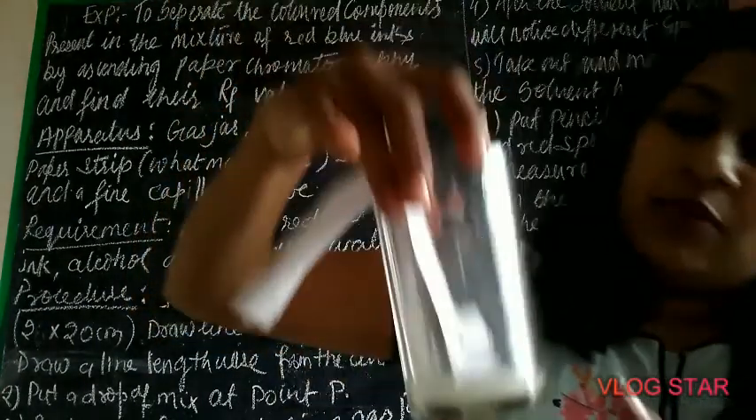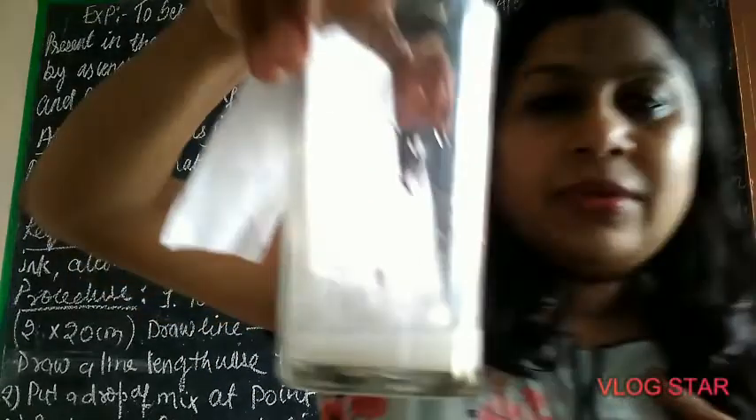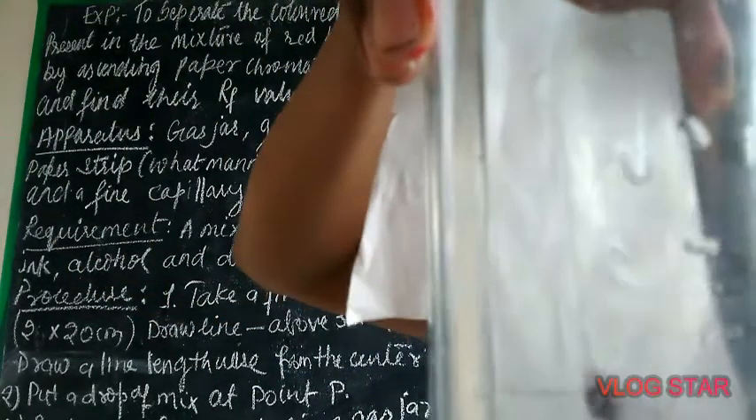We'll keep it aside for some time and later see what is happening. You can see the solvent is rising up the filter paper strip.